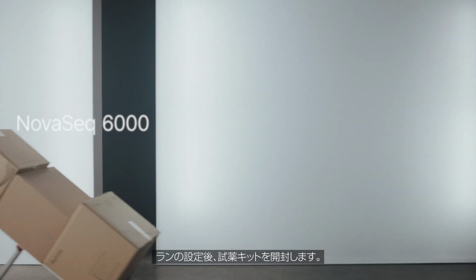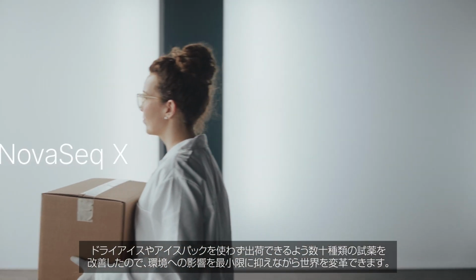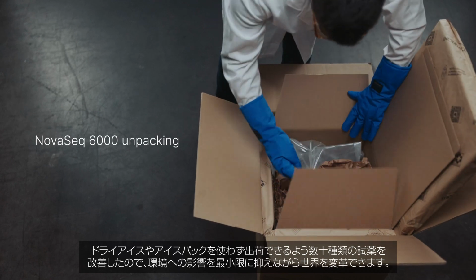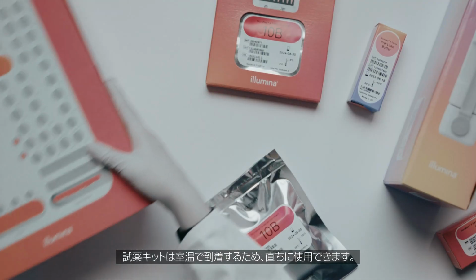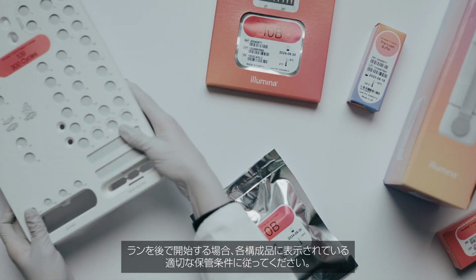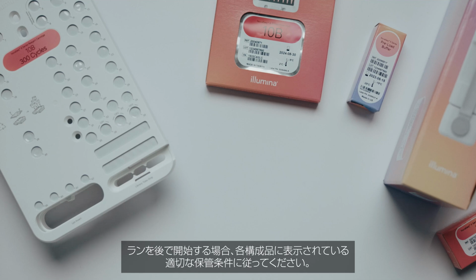After setting up your run, unbox your reagent kit. We have reformulated more than a dozen of our reagents to enable shipping with no dry ice and no ice packs, so you can change the world while minimizing your impact to the environment. Because your reagent kit arrives at room temperature, it's ready to use immediately. If you'd like to start your run at a later time, follow the proper storage conditions listed on each component.